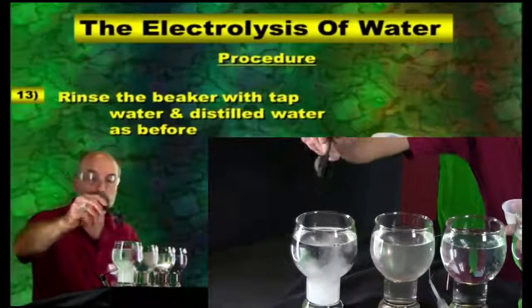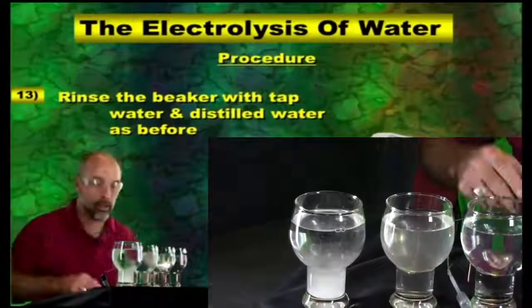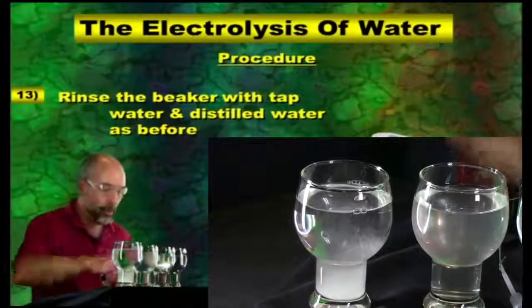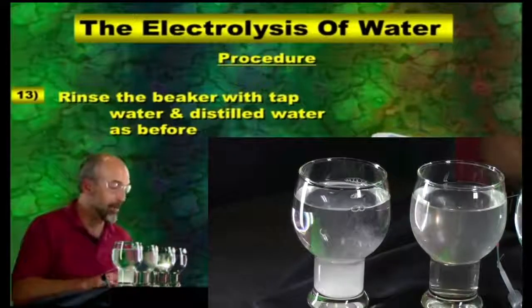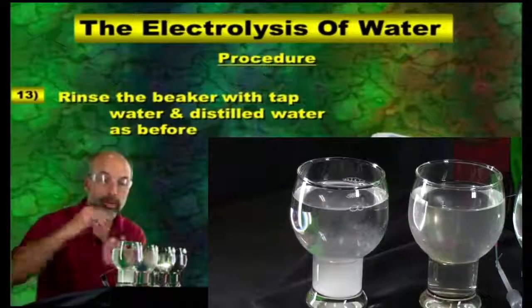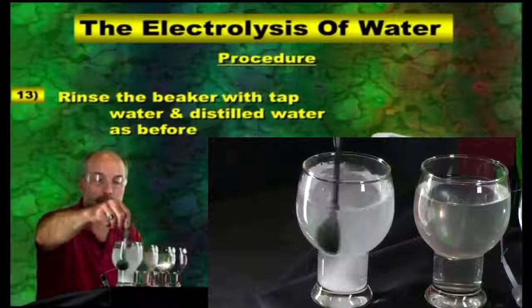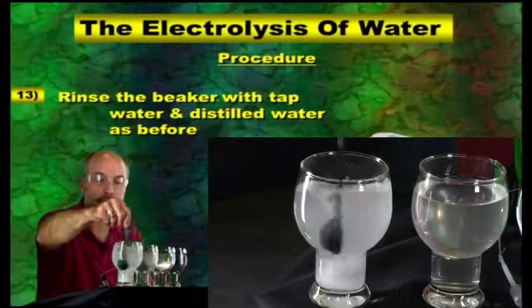And what we want to see is whether or not this substance, I don't have a chemical formula at all to look at to be able to predict anything, but I want to see whether I see some kind of a change take place. So we'll take this spoon this time, go around and around and around, make some nice little swirls.